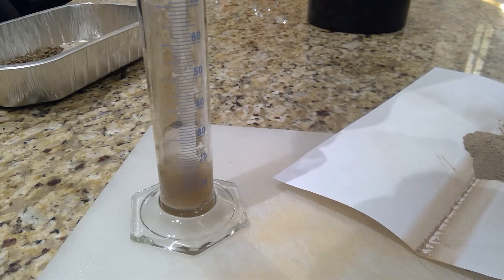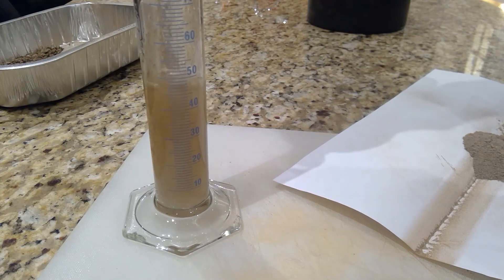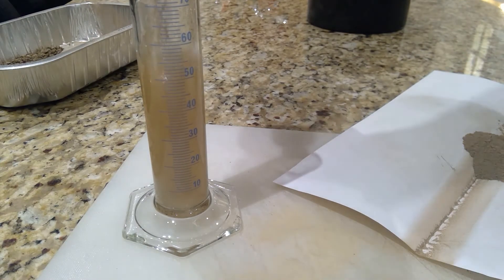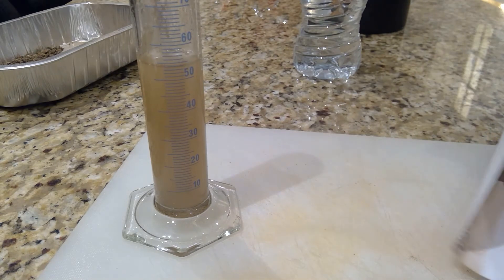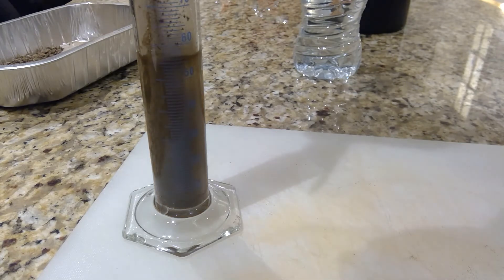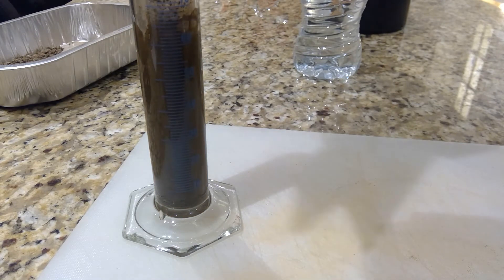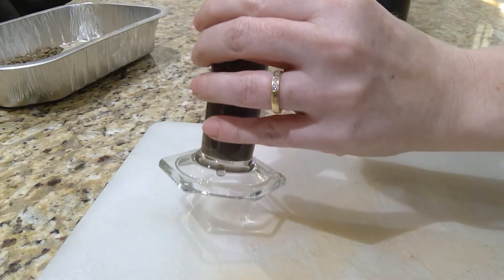I'll go up to the 50 mark. The reason I don't put the water in after the soil sample is because the soil sample will cake at the bottom and you won't get it moved. I'm just putting it in, trying not to touch the sides, and then I'm going to wash down the sides.